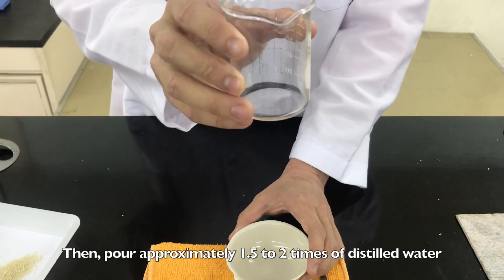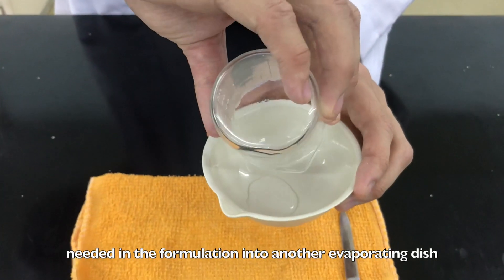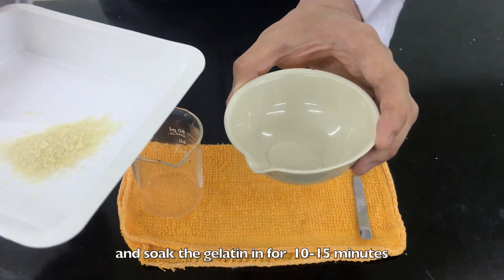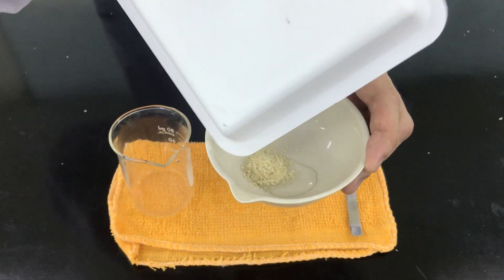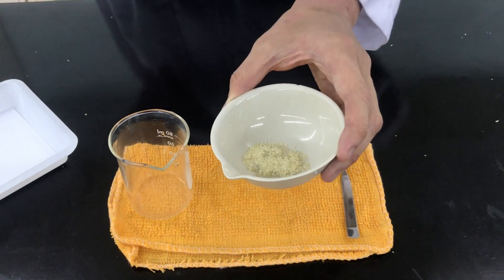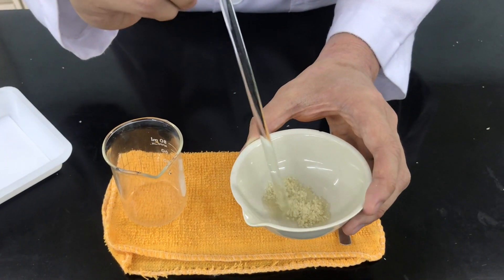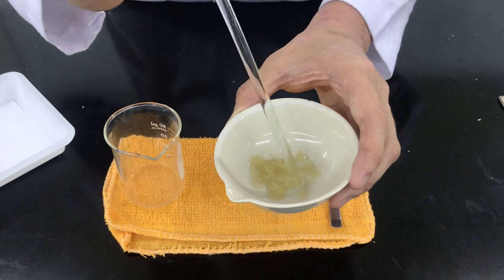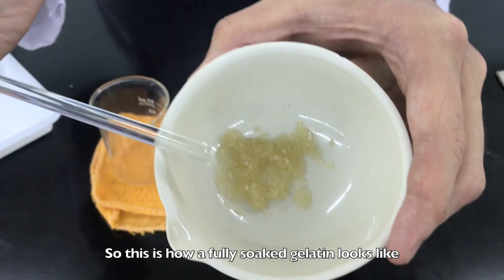Pour approximately 1.5 to 2 times of distilled water needed in the formulation into another evaporating dish, and soak the gelatin in it for 10 to 15 minutes. This is to make the melting process of the gelatin faster afterwards. This is how a fully soaked gelatin looks like.